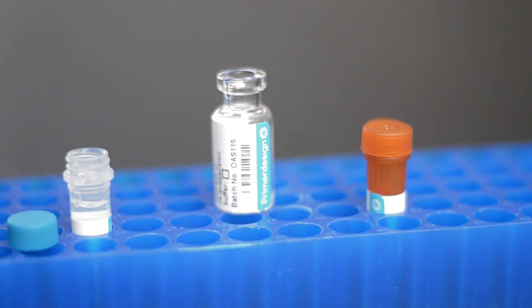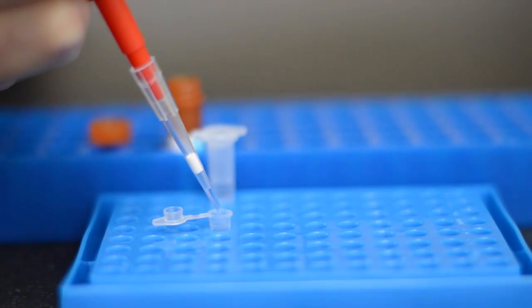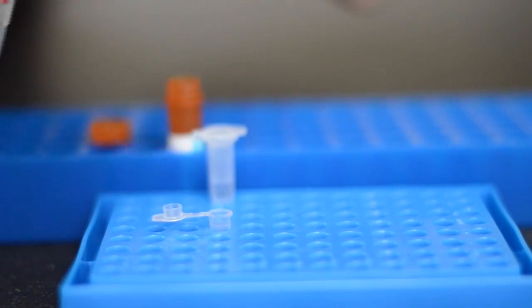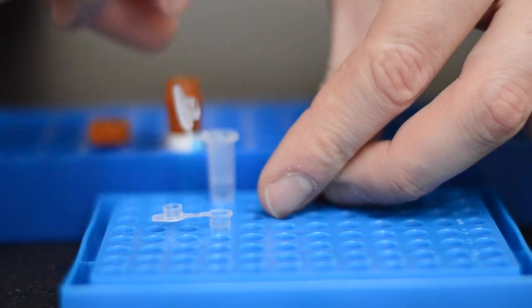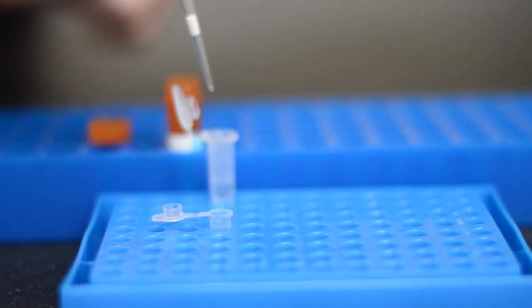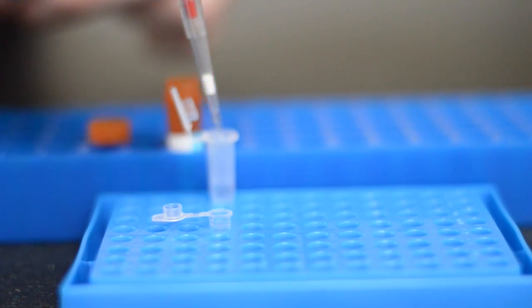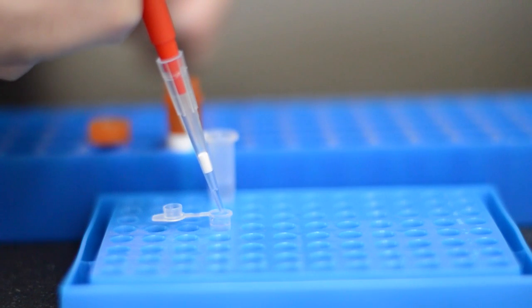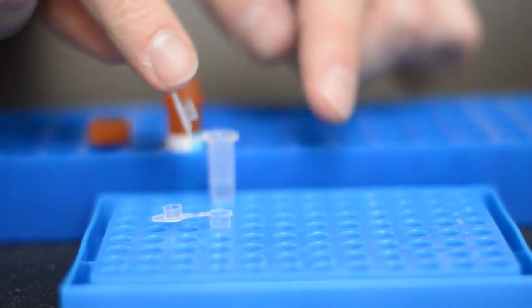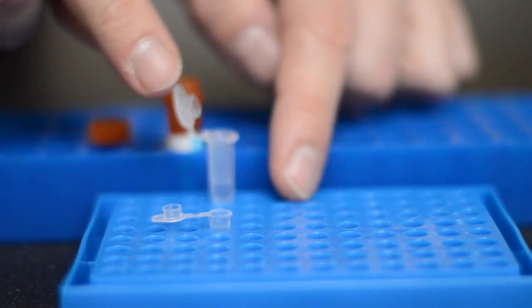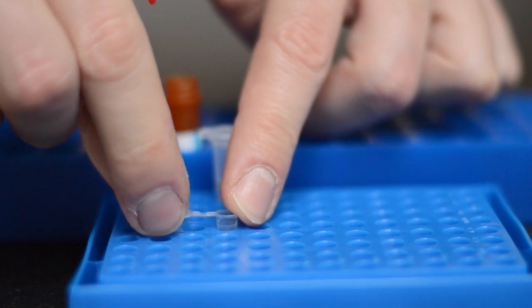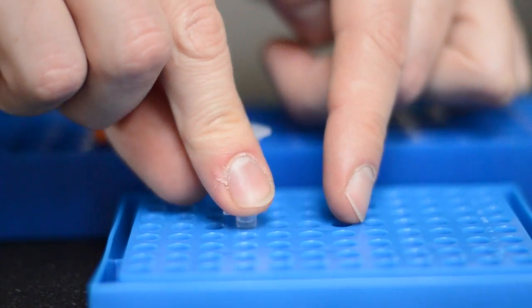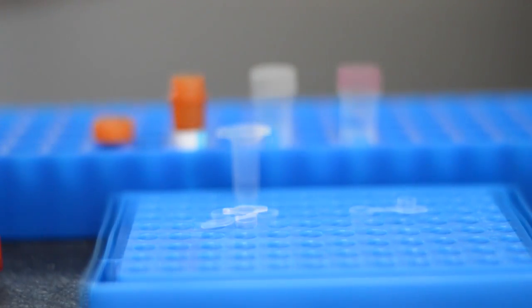So to set up a test simply combine a small volume of this reaction mix with a small volume of your DNA sample. Close the lid and everything's ready.